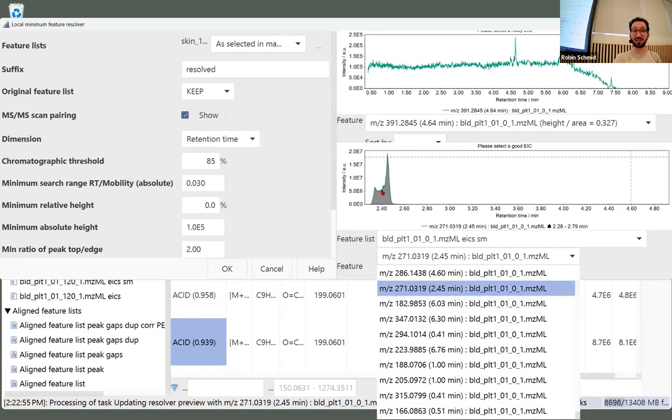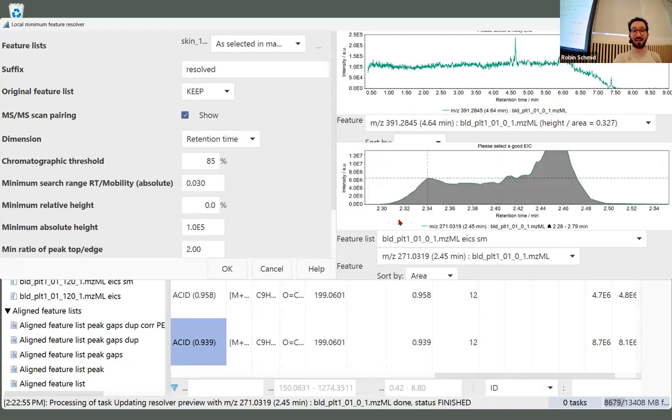And you can see this one is very hard to even make out, even as an expert, to say what's happening here, right? It might be a mixture, the injection might have been too much ACN or something, like methanol or something in there, or it might be overloaded, might be 3 compounds, might be 2.